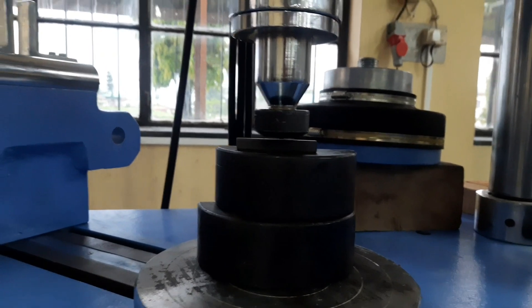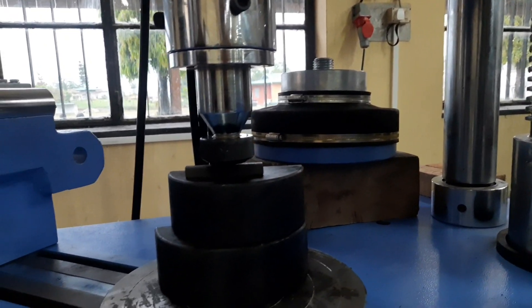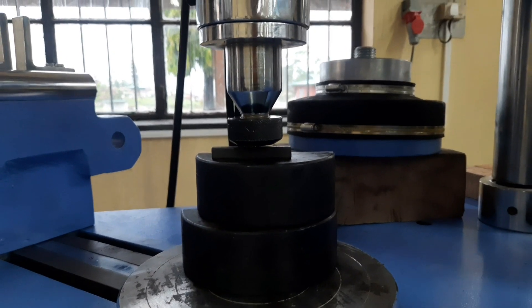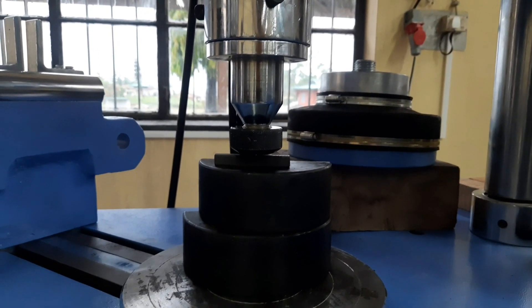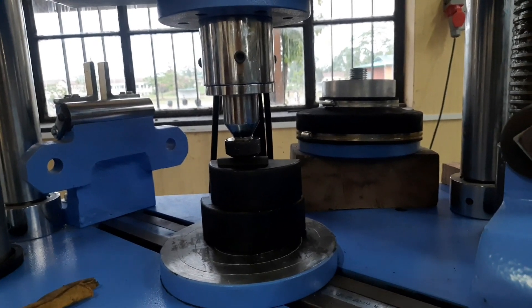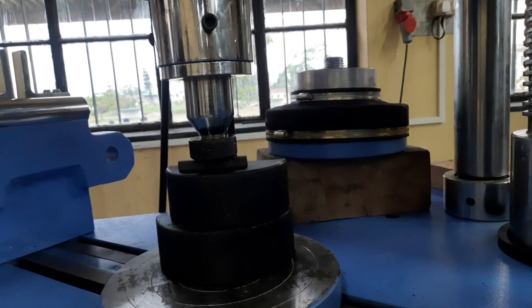Do not disturb the valves. We close the valve and measure the indentation on the specimen. The result of how much load is applied can be seen on the digital screen.